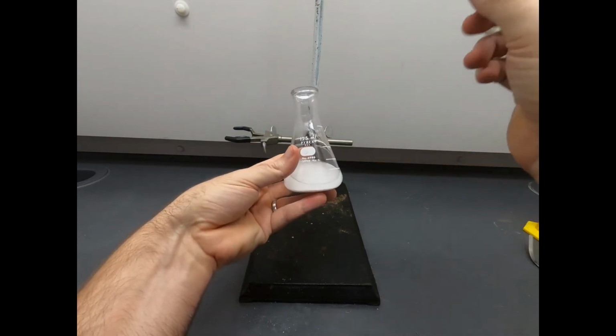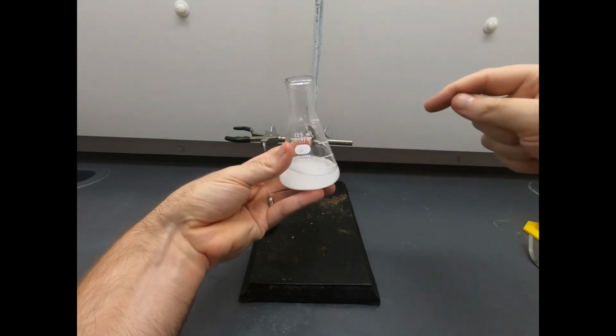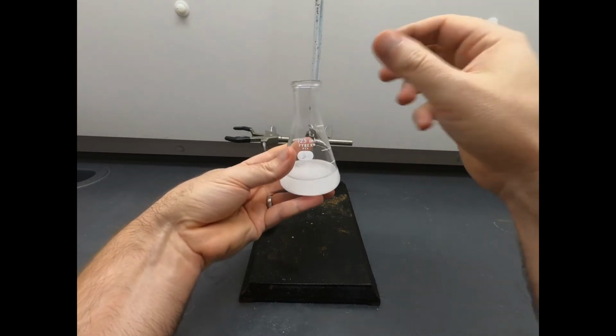So I need to do two things. One, I'm going to put a stir bar in here, and two, I'm going to put this on a stir plate and just let it stir gently for about 30 minutes.